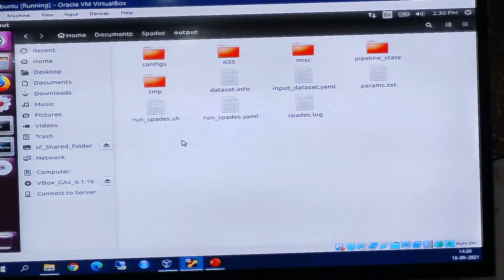Can we add it in between? Yes, you can use the left arrow key to go there. Minus t space 2, now enter. Then the right arrow key. Output will show in documents.